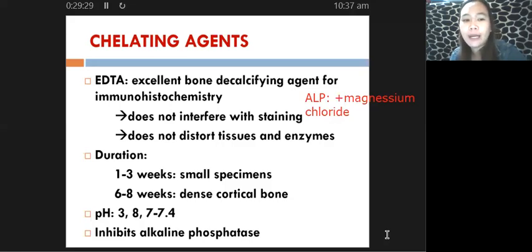So let us go back to the duration. All right. So we all know that in the case of your decalcification, the decalcifying solution is used up in the process. So that means the effectiveness of your decalcifying solution decreases as the process progresses.